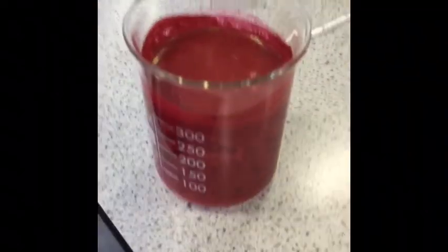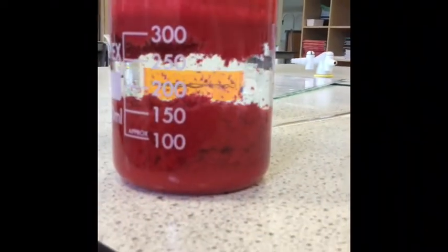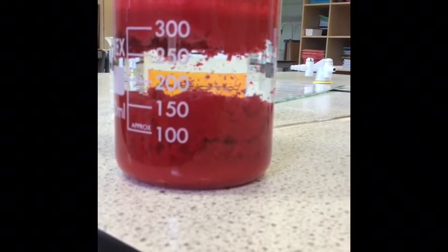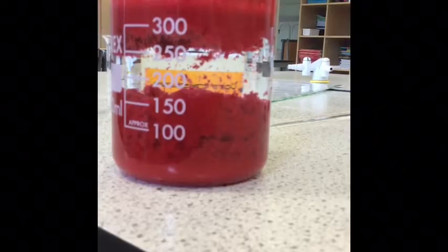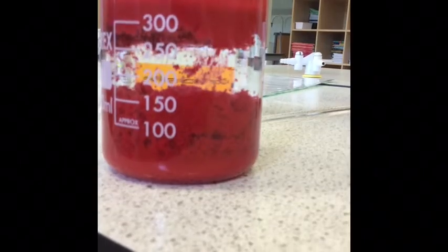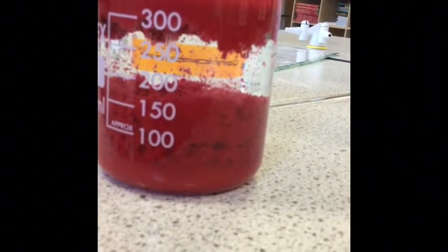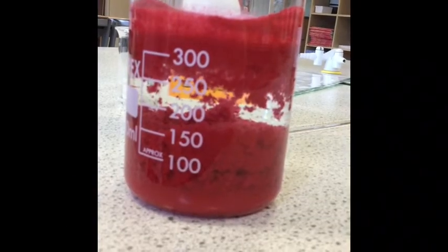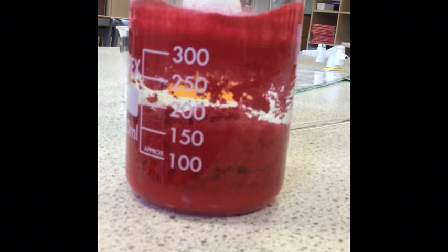So what I'm going to do is insert the pipette into this clear area in the middle and add some more of the ammonia solution. I'm then going to add a pipette of the dimethylglyoxime into the middle area again and see if some more precipitate appears. I don't think any more did appear there. We were just disturbing the precipitate that was already produced.